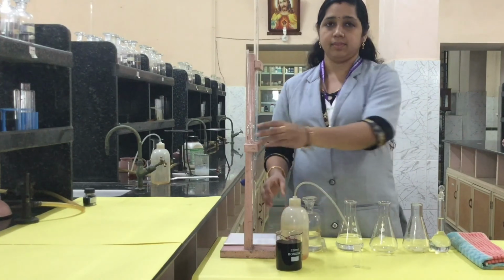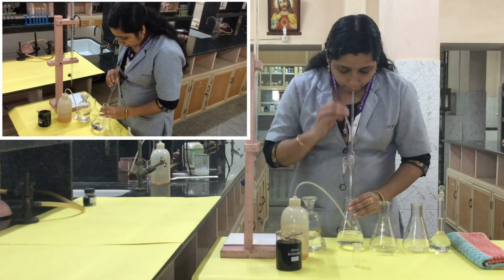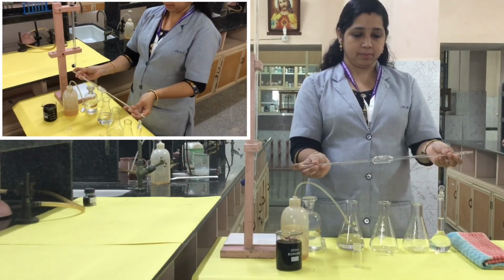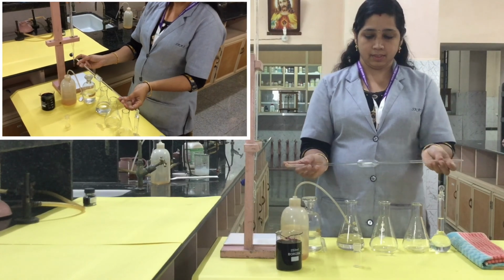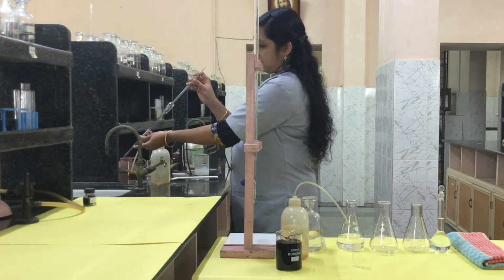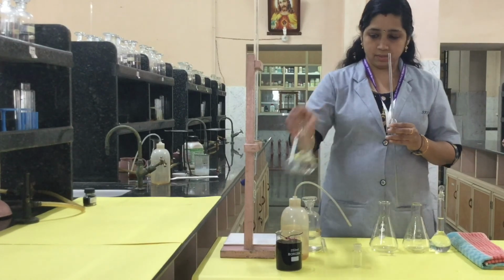For carrying out the titration, we already prepared the standard solution of Mohr salt. So next we want to pipette out the solution for titration. Before that, you have to rinse the pipette with water. Rinse this pipette like this. Just rotate this pipette. You can see the water reaches the level, and now just rotate it and you can see the water is removed.